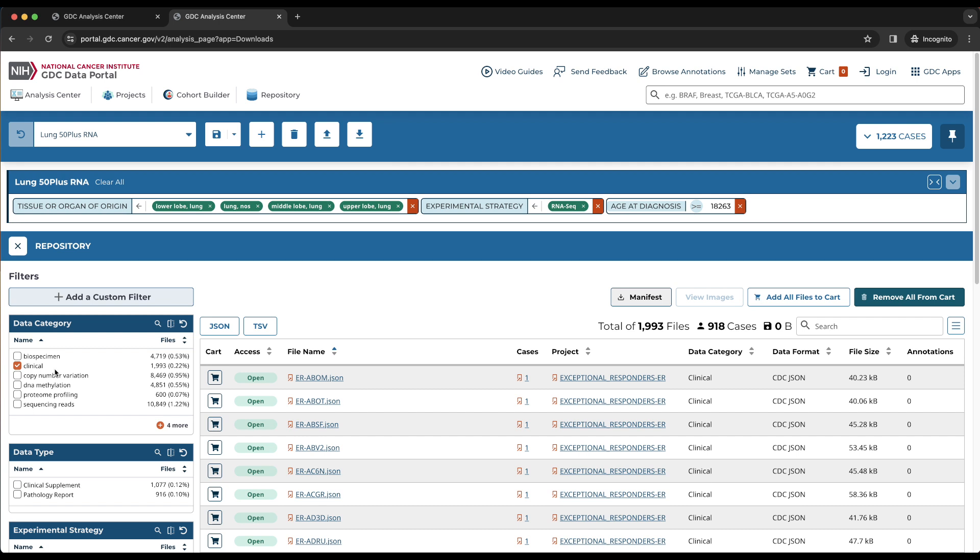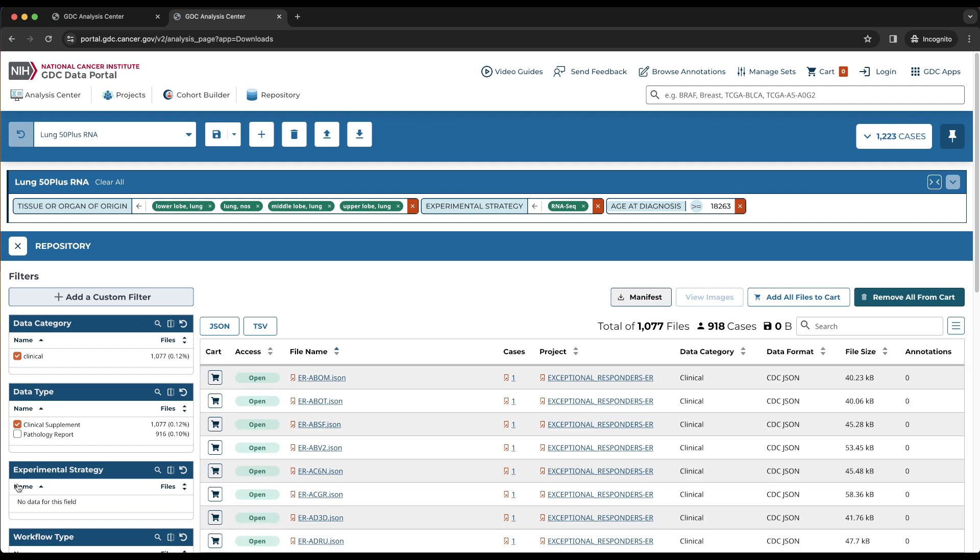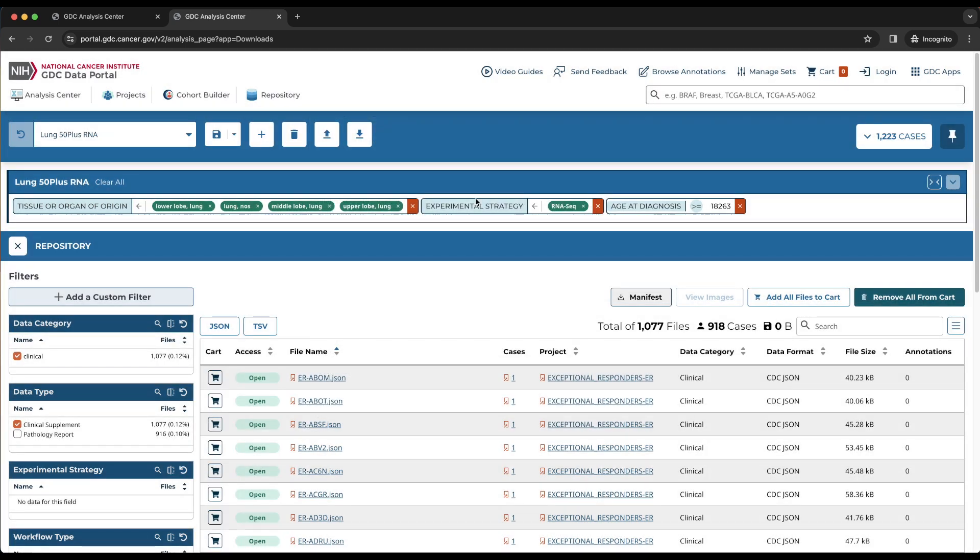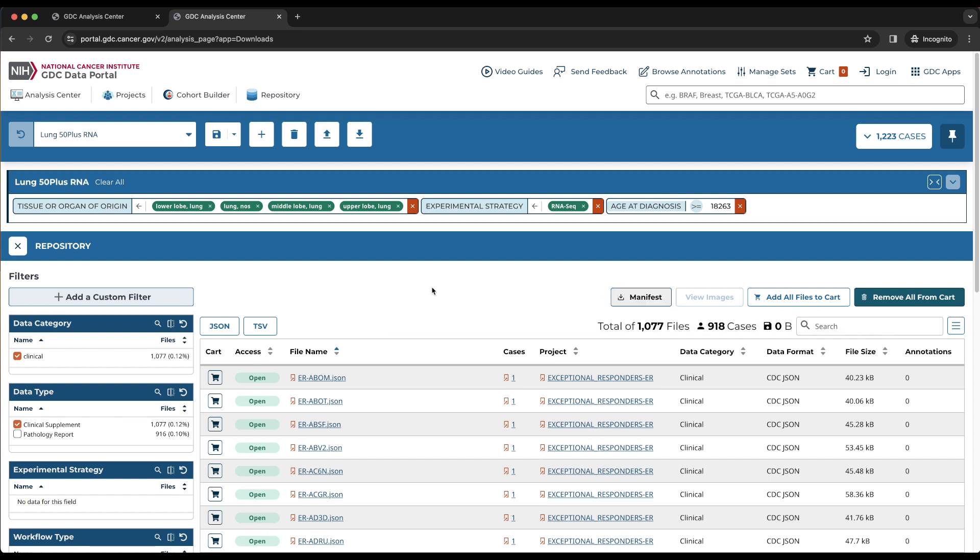See how the rest of the cards update in real time as filters are applied. To filter further, we will click on clinical supplement under data type. The fields that do not appear by default can be added using the Add a Custom Filter button at the top of the portal. This concludes the first filtering step, and a manifest for the resulting 1,077 files can be downloaded by choosing the Manifest button above the table. This can be used to download these files with the GDC data transfer tool. The filters can be reset by choosing the circular arrow buttons.